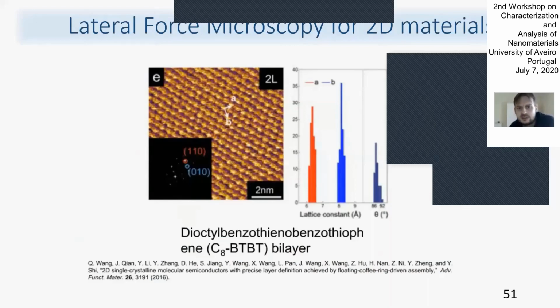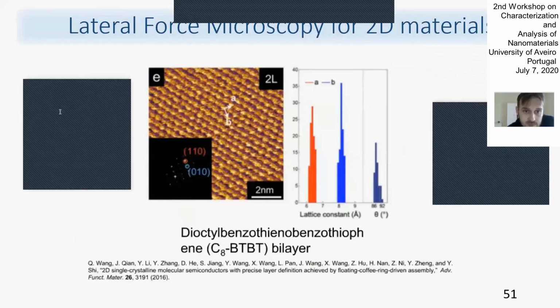No, I think this is a single molecule, not atoms. I remember only one paper with visualization of a single molecule, but in AFM it's difficult to do. It's not extreme. No, 1 nanometer, I think, is the maximum.